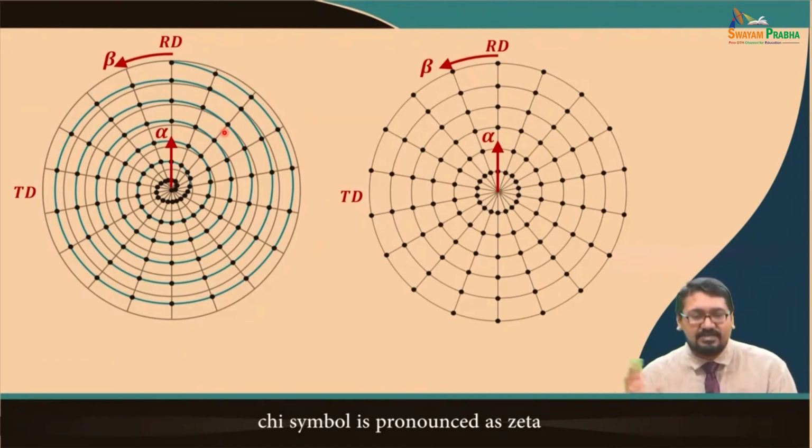We will come to that in a different lecture, not in this one. So a spiral is obtained where the sample is stopped at certain alpha and beta, and then the intensity of the diffracted beam for a certain theta for a certain HKL plane is noted, and thereby the whole pole figure was measured. This was done earlier.